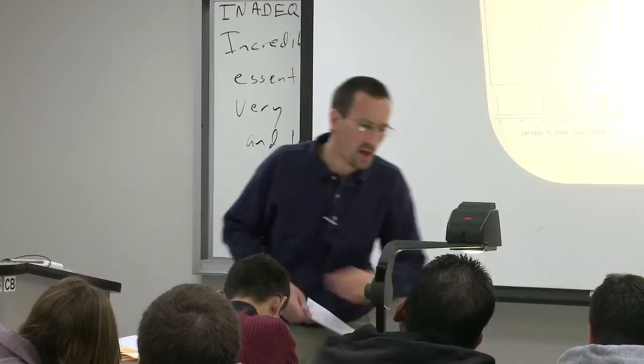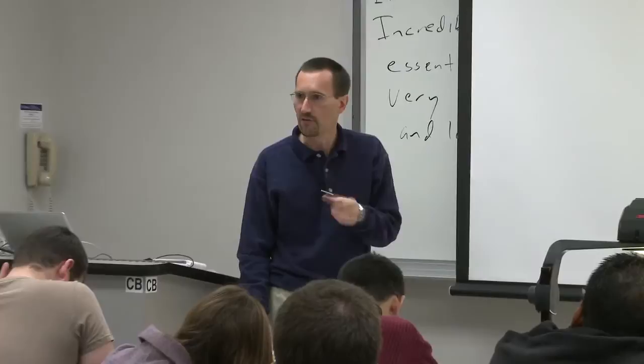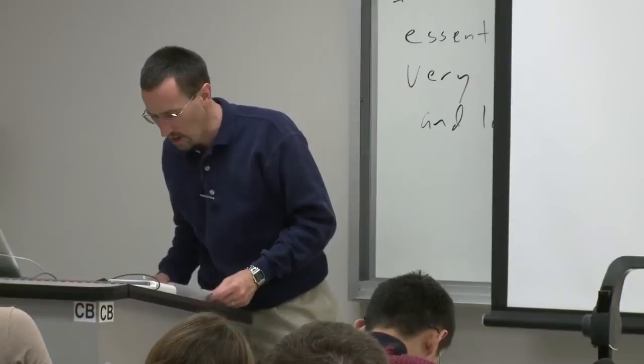So one of the frontiers in NMR right now is really small probes and probe volumes, so that you can concentrate your sample in a very small space and get enhanced signal-to-noise ratio with small samples. In a way, a five millimeter NMR tube, the typical standard, is a big sample in the sense you're putting a lot of milliliters in there, but it's a very convenient size for preparative chemistry. It's just that by the time you're dealing with a really late stage intermediate, say in a long total synthesis or a natural product, it may not be enough.